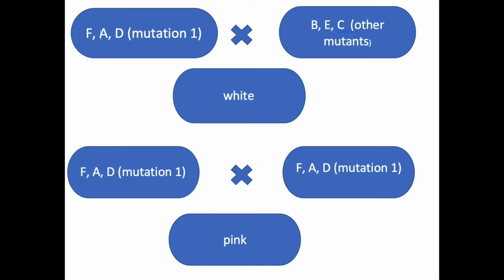Based on the map, there are 2 possible errors. Either I made a mistake when placing the colonies and double placed one of the 6, or there were more than 2 mutations present in the samples, which allowed for a greater number of complementations.